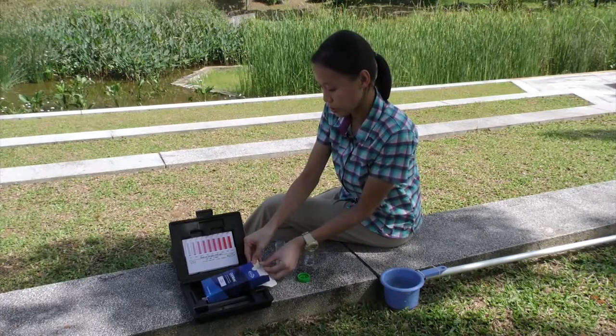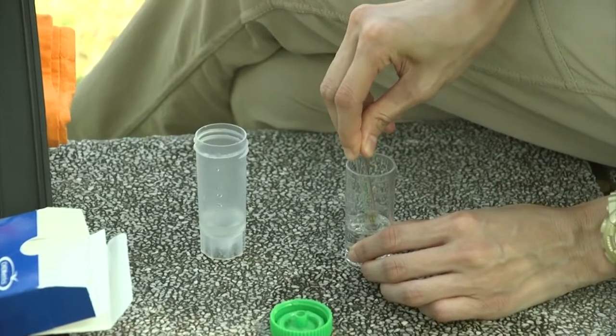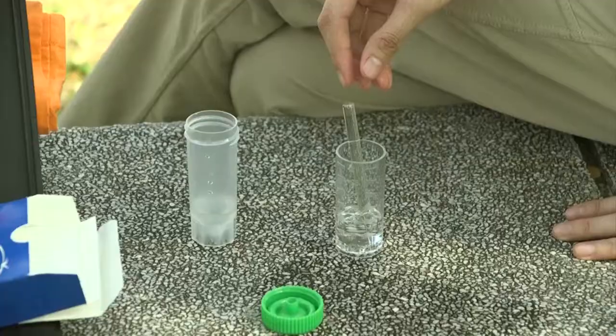Place the nitrate ampule tip first into the sample cup and snap the tip by pressing it against the side of the cup. Do not remove the ampule until it is fully filled. There will be a small bubble to facilitate mixing.